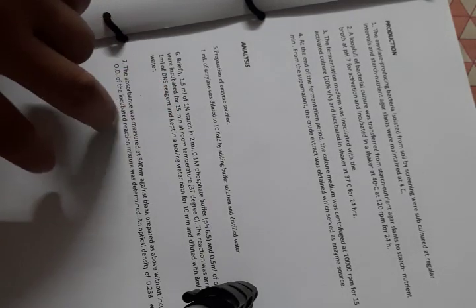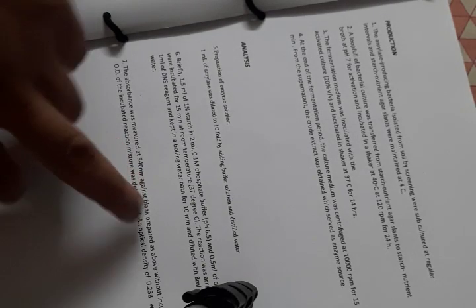Then that amylase is allowed to degrade starch. Here these things are written: 1.5 ml of 1% starch and buffer solution to maintain the pH. So that reaction was done, and then to check the maltose produced, spectrophotometric analysis was done. So the optical density was obtained.